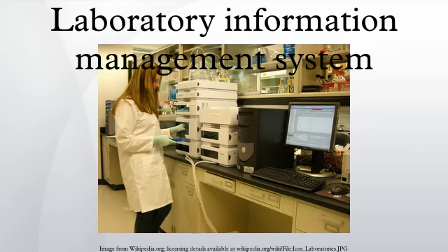That functionality can roughly be divided into five laboratory processing phases, with numerous software functions falling under each: the reception and login of a sample and its associated customer data, the assignment, scheduling, and tracking of the sample and the associated analytical workload, the processing and quality control associated with the sample and the utilized equipment and inventory, the storage of data associated with the sample analysis, and the inspection, approval, and compilation of the sample data for reporting and/or further analysis. There are several pieces of core functionality associated with these laboratory processing phases that tend to appear in most LIMS.